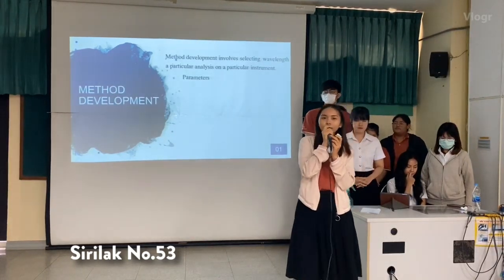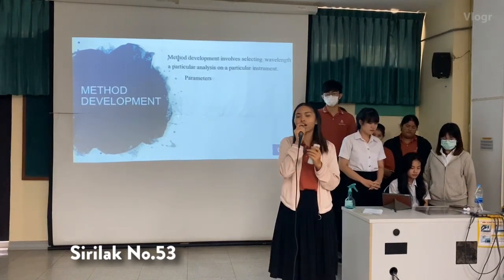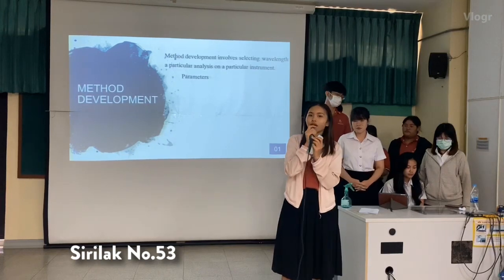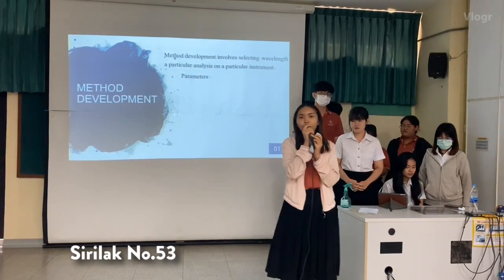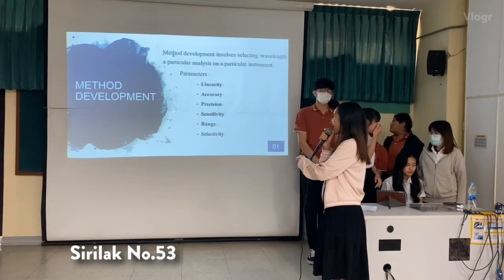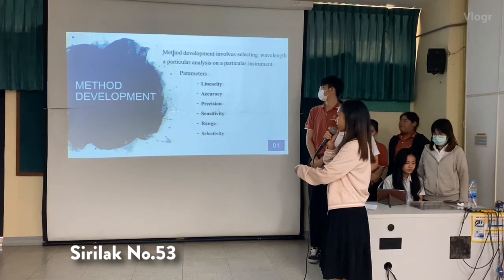Method development involves selecting the wavelength or wavelengths that yield the best result for a particular analysis on a particular instrument. We should define the parameters prior to analysis for optimization of methods, such as linearity, accuracy, precision, sensitivity, range, and selectivity.